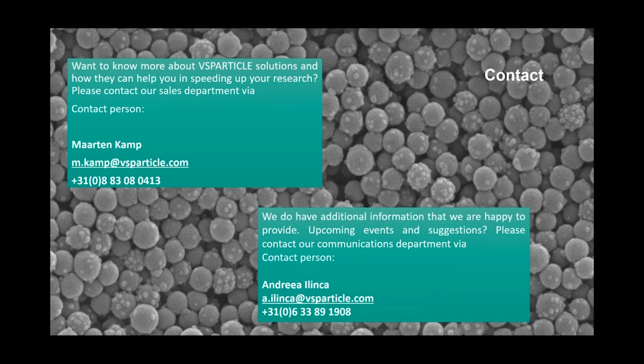Since the process is optimized for the really small nanoparticles, we have even proven that we can go down to atomic clusters. Most of the nanoparticles that we synthesize are spherical, due to the fact that particles of that size are spherical by almost definition. We have seen some very nice results at some of our customers. I think it's still unpublished, that if you synthesize or sinter agglomerates, which is a collection of different primary particles together, in a later stage, you can see all kinds of structures appearing. But that's really a new field that I think is unexplored at the moment.